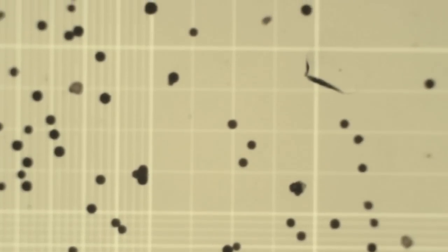So now we want to move to the next chamber. We're going to go back up, quickly focus. We're going to now center into the upper right, back down. Okay. There's an odd looking particle there. We won't count that as 2 particles, we'll count that as 1. There's an artifact, we won't count that one at all.